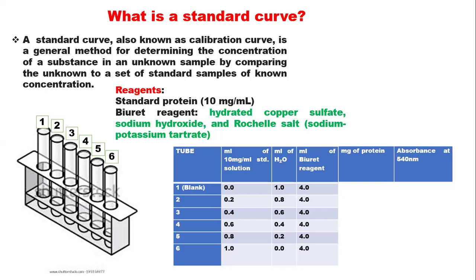spectrophotometrically. So what you will do after you add all these components is incubate. There is an incubation time that will be given to you. Okay, so you allow that. The essence of that incubation period is to allow the reaction to take place between the biuret reagent and the protein that you have added.